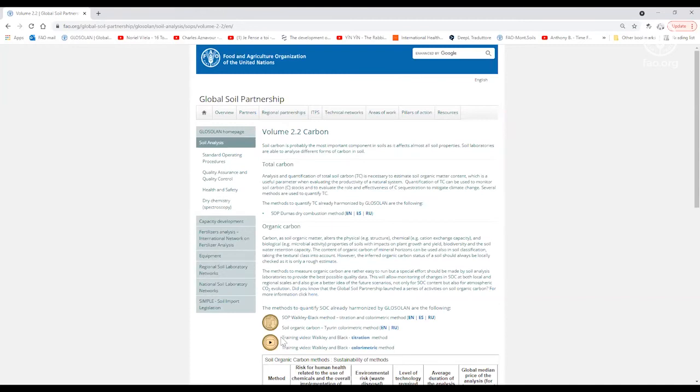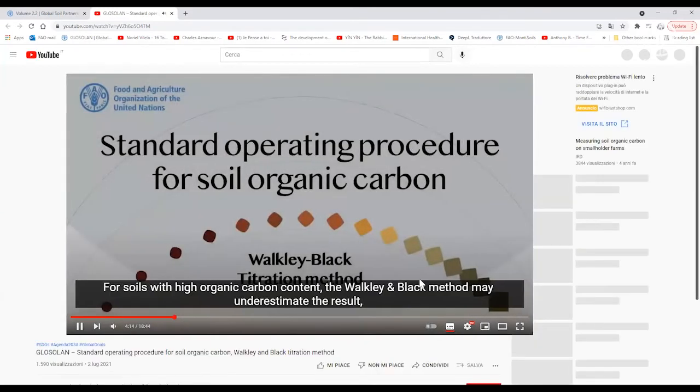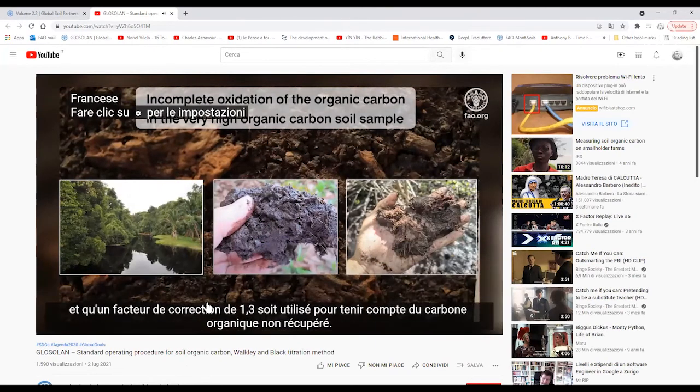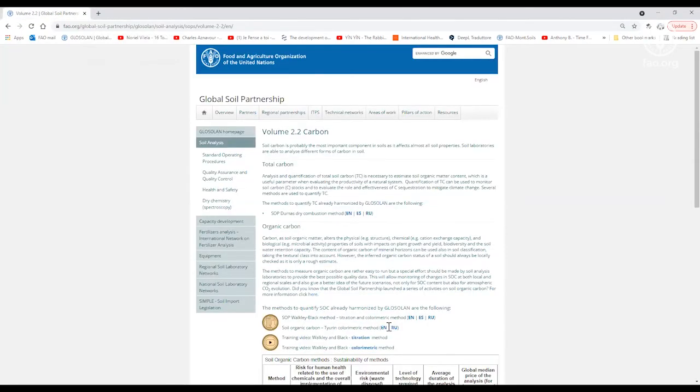So for instance, there is here a training video on Walkley-Black, both titration and colorimetric methods. So just click here and you will see also a video for the implementation of the procedures. You can select the subtitles in different languages here. And you can, for instance, follow it in French, Spanish, Arabic, and so on. Or you can download the file here. Well, if you go back here to the SOP webpage, you will find an item called sample preparation. Just a second, it is uploading.